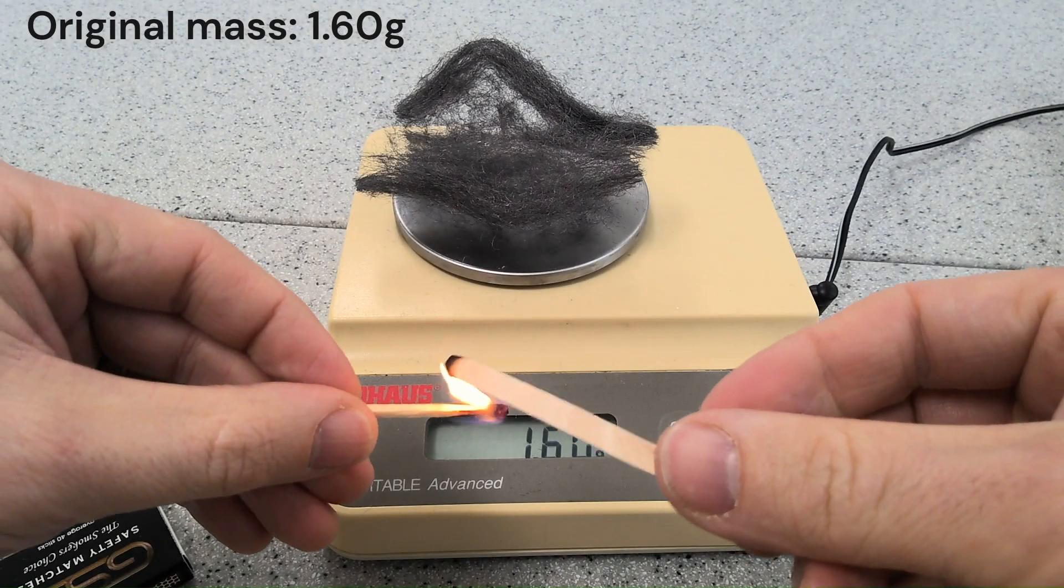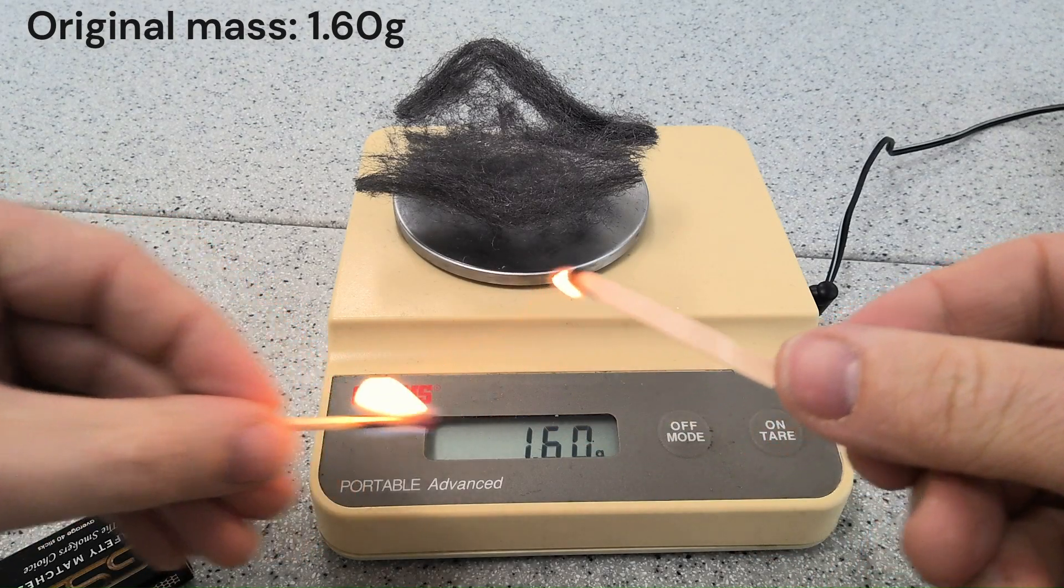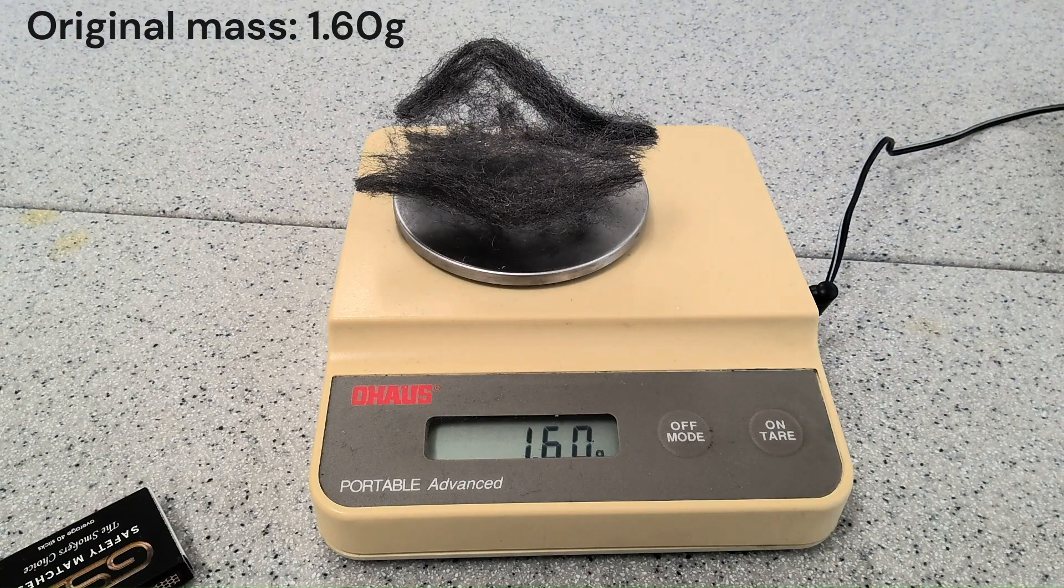Watch the readings on the electronic balance. If you record the mass every 5 seconds, it is easier to see the trend in the data.